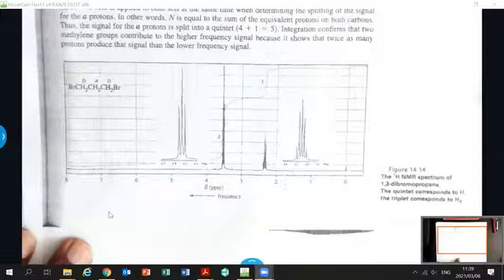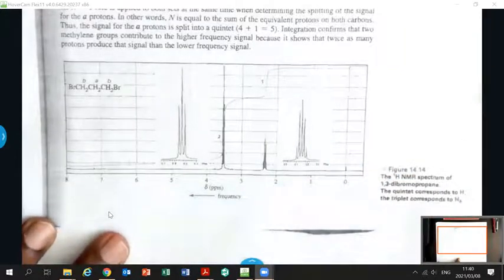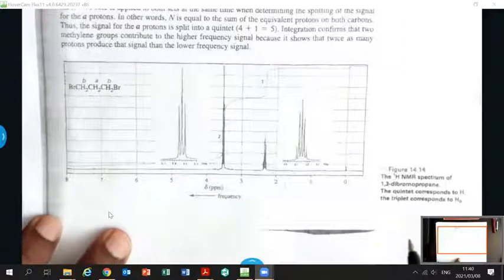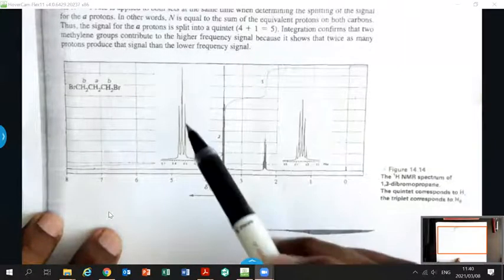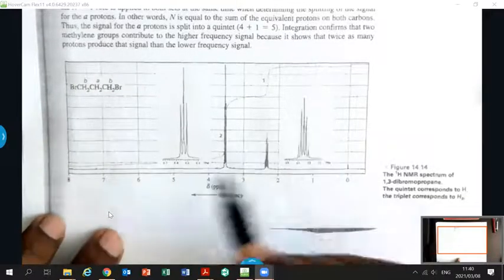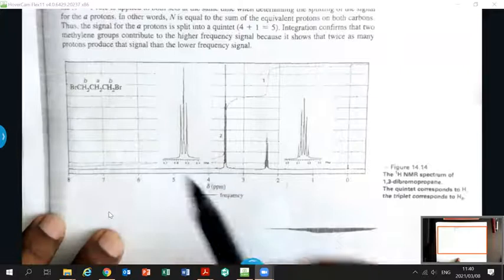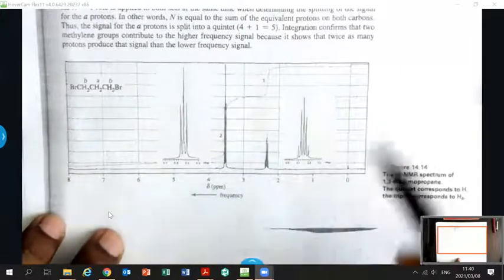All right, so our NMR spectrometer is in the basement of chemistry, and you'll find there that we have two NMR spectrometers, a 400 megahertz and a 600 megahertz, and we can run spectra like this. So you bring this molecule to us, we can give you a spectrum like this and tell you what that particular molecule is, just based on something like this that you could probably do.